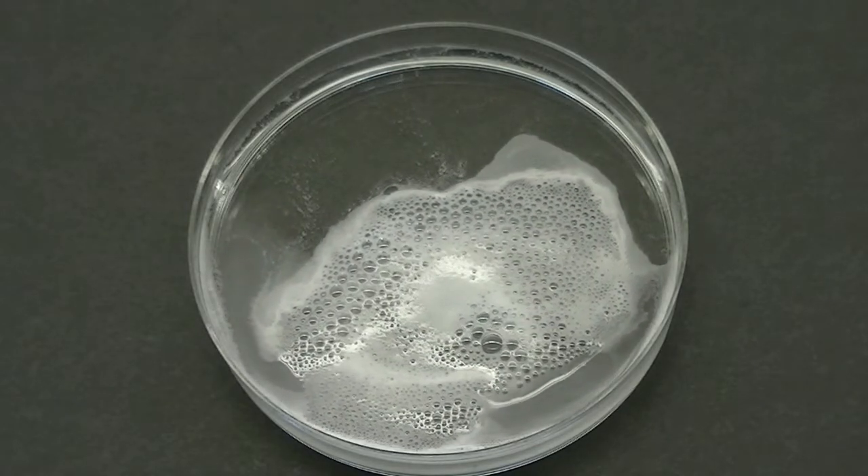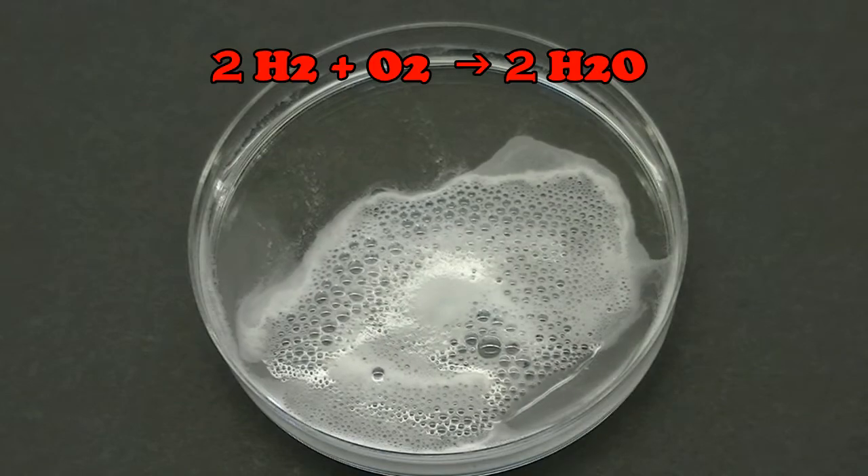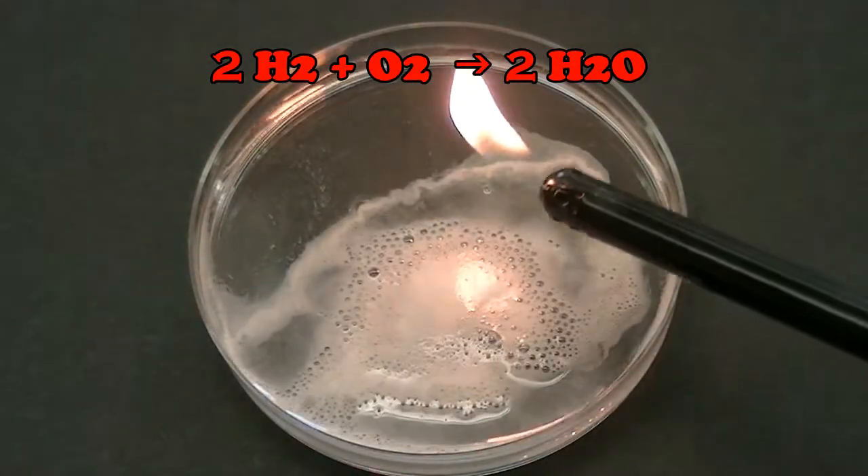The hydrogen gas, when ignited, reacts with oxygen in the air to produce water and a lot of energy.